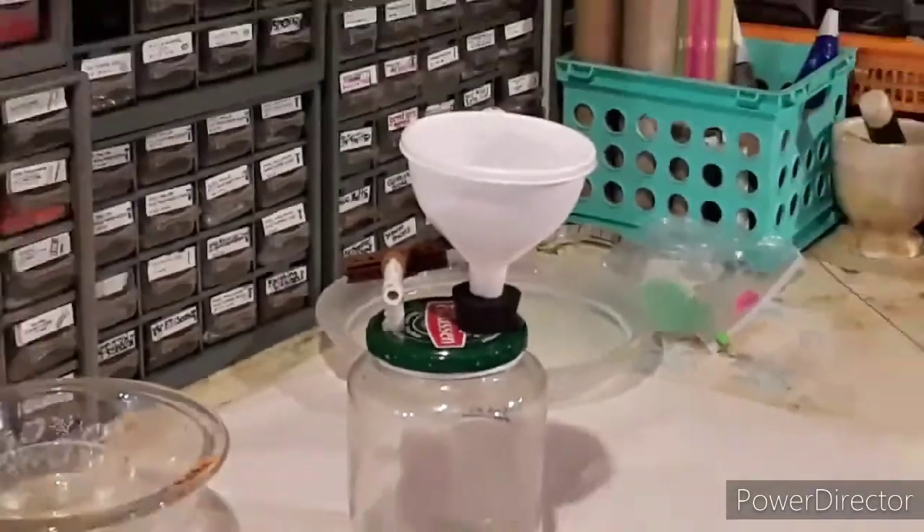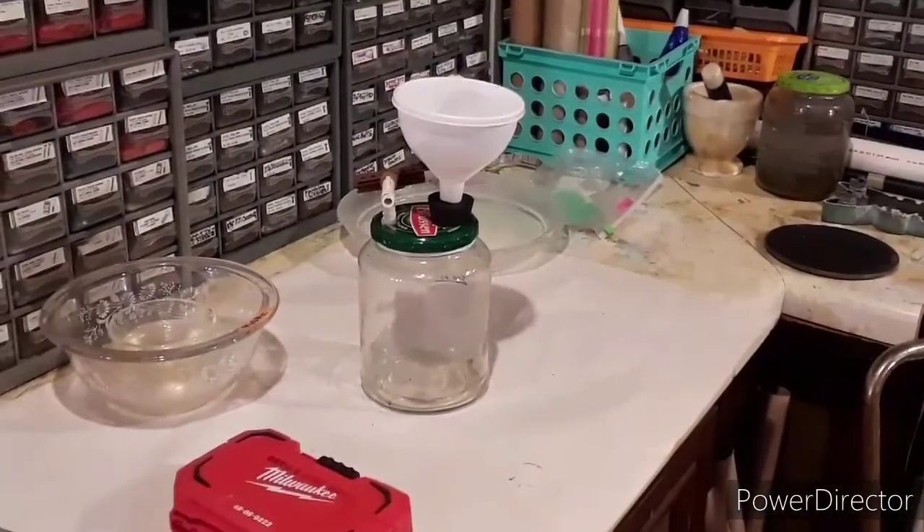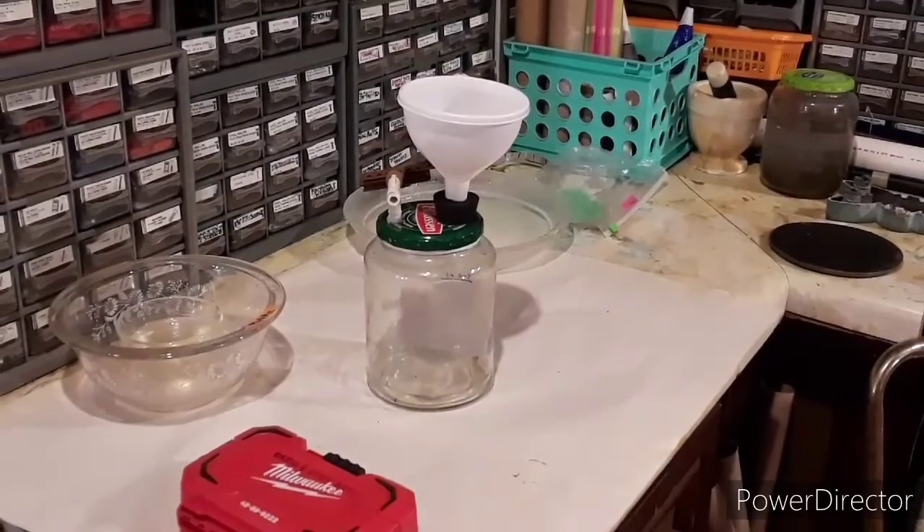That's it for this video. I just wanted to show you guys something I came up with, and I'll tell you what — it works great. It works just as well as my Buchner funnel that I bought. I've actually been using this more than any of my other funnels for filtrations, just because the container is built right onto it — I don't have to worry about getting a filtering flask out or hooking up a jointed funnel to a filtering flask or any of that. I hope this is useful to some of you, and if there are any questions, feel free to leave them in the comments.